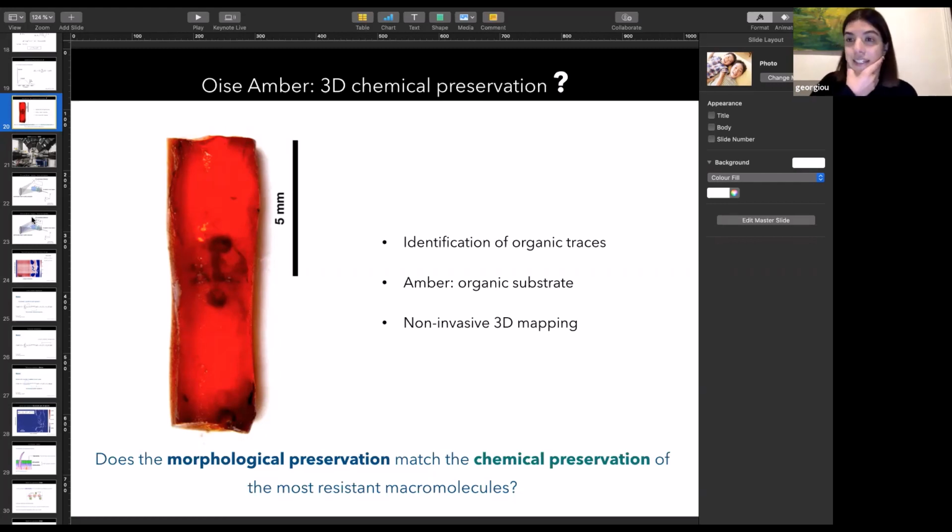We collected this data with only one monochromator, the low resolution monochromator, to have more flux on the sample. What I would do today is to also include the second step monochromator at ESRF, the high resolution monochromator.